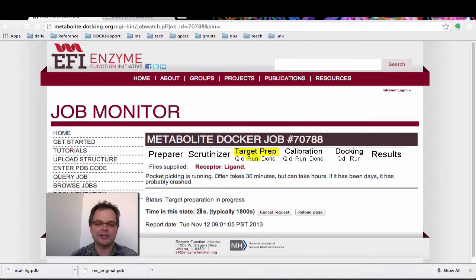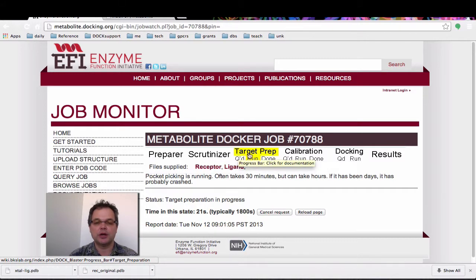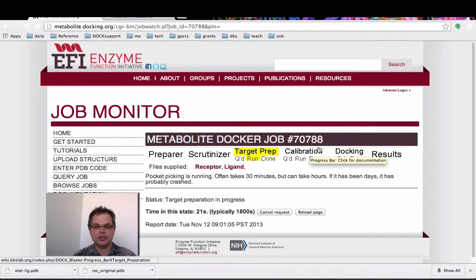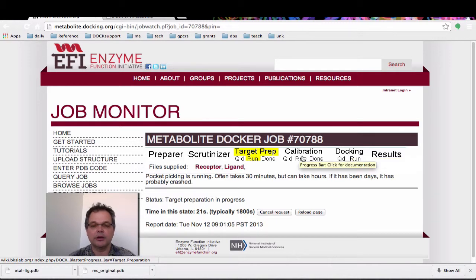It's only been running for 21 seconds and it might take 30 minutes. So this is going to be the end of part one of a three-part video showing how we do metabolite docking through a website. It's going to finish target preparation, then do some calibration by docking some molecules into the binding site as a sanity check on the docking parameterization. Then in part two, we're going to launch a docking screen of a library, provided the preliminary docking worked okay.